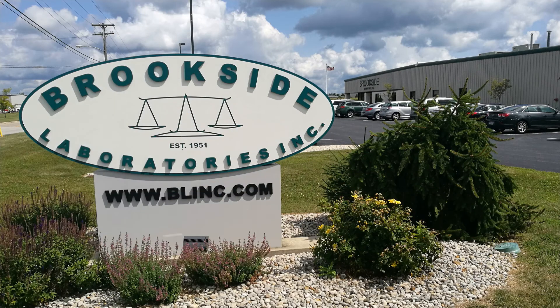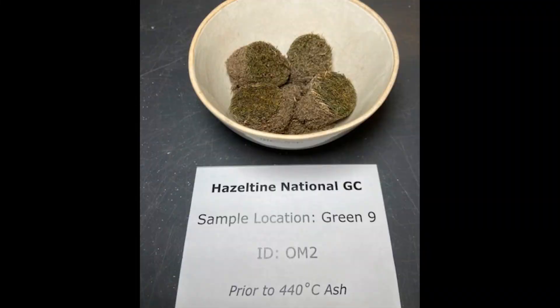The samples were shipped to Brookside Labs in Ohio. At Brookside, the samples are dried again — this time not to stop microbial activity, but to make sure there is no water in the sample prior to taking the initial pre-burning mass. Here are those samples from the 9th green in a large crucible ready to go into the furnace.